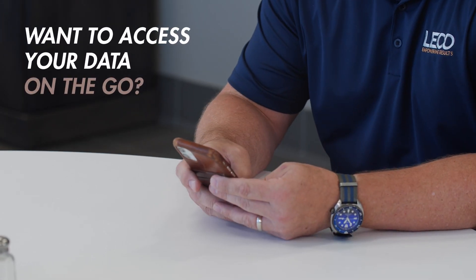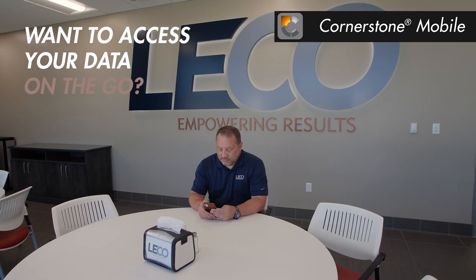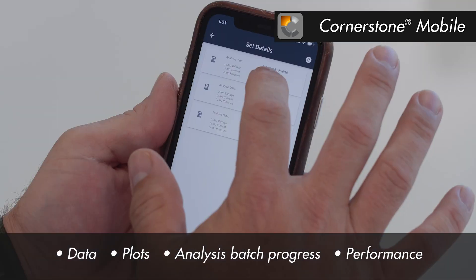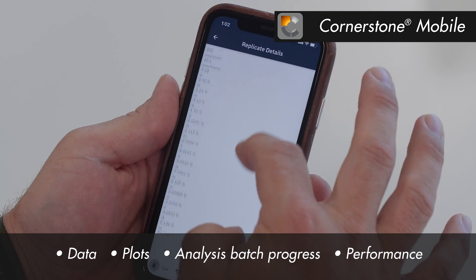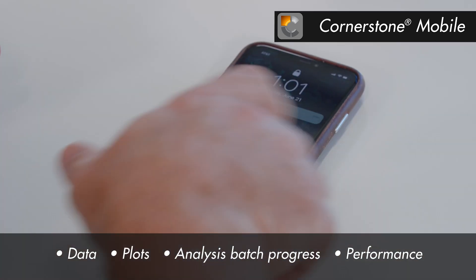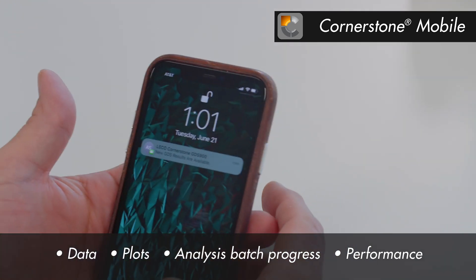Want to access your data on the go? Our mobile software application feature, Cornerstone Mobile, allows you to view your data, plots, analysis batch progress, and performance all from your smartphone or tablet. Set up notifications for specific instrument conditions so you don't miss a thing.